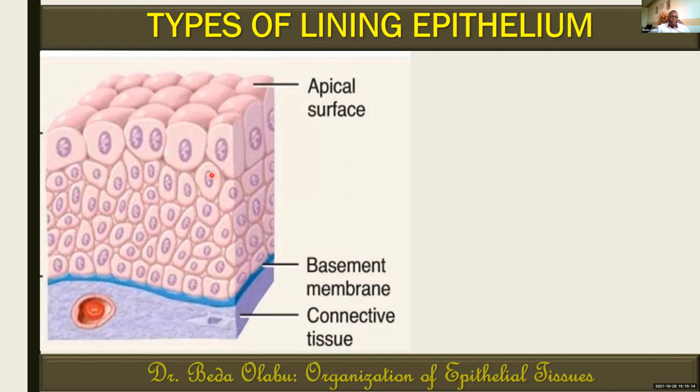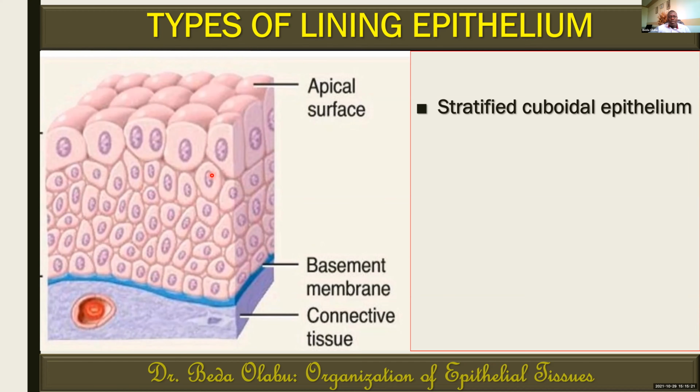Let's look at this one. Very unique. There are some things I want you to capture in this image. One, we can appreciate that the epithelium is definitely stratified. When you look at the shape of the cells on top, we can also appreciate that the cells on top are actually cuboidal. So we can say this epithelium is stratified cuboidal, and there's nothing wrong with that.